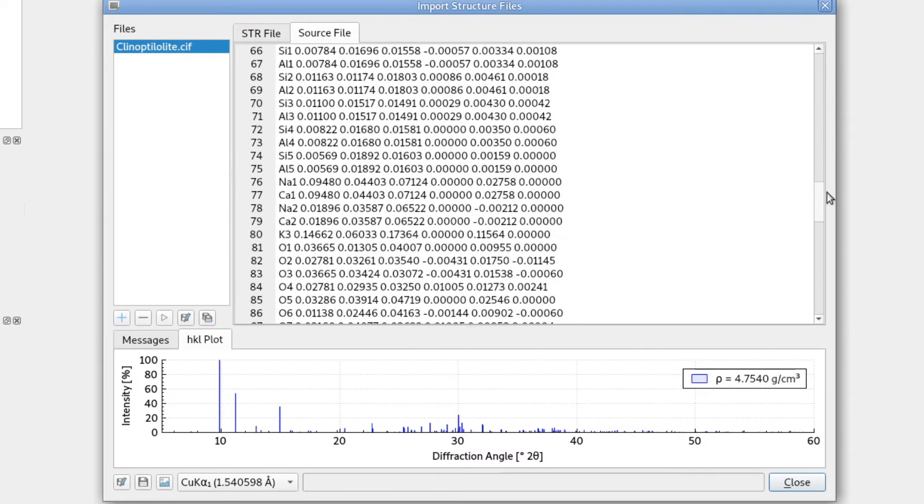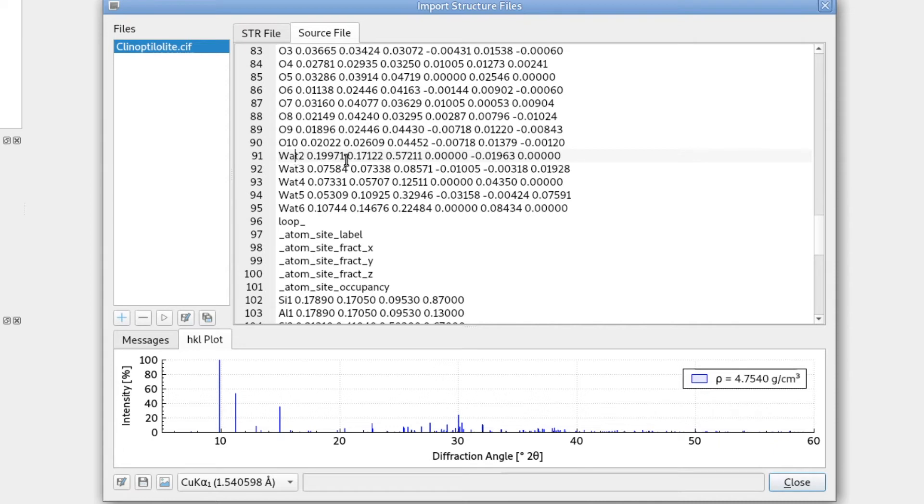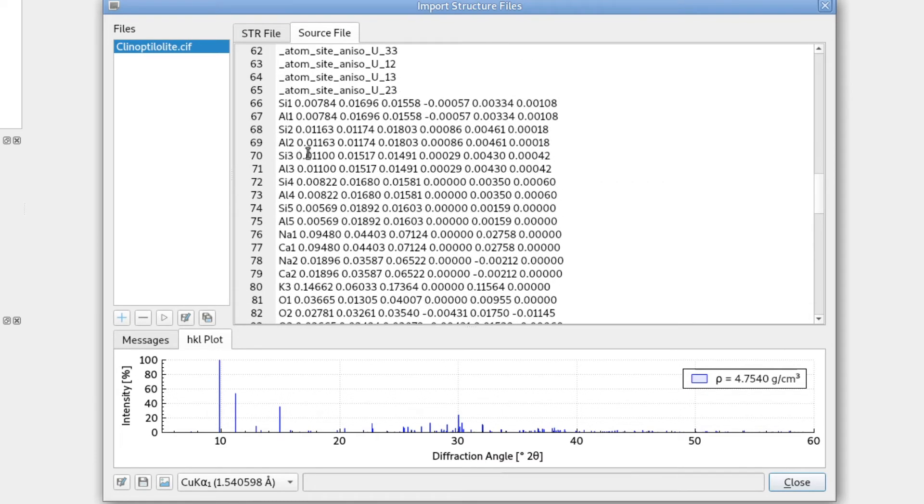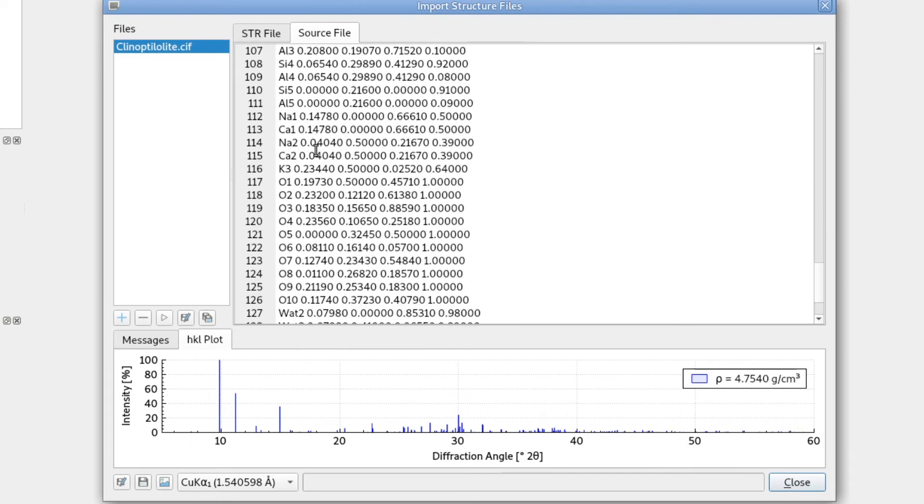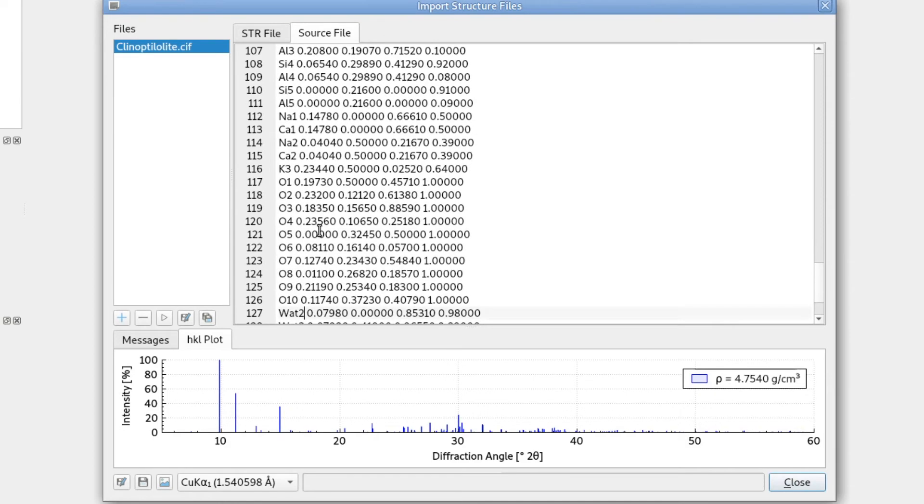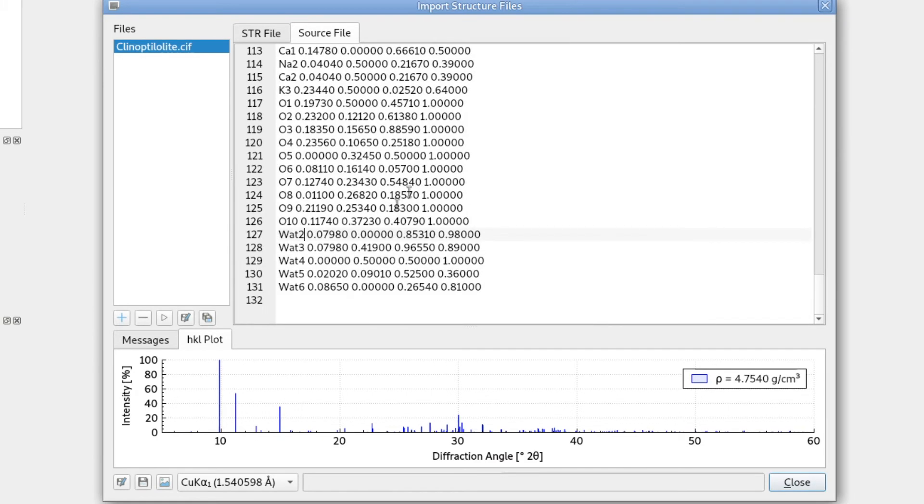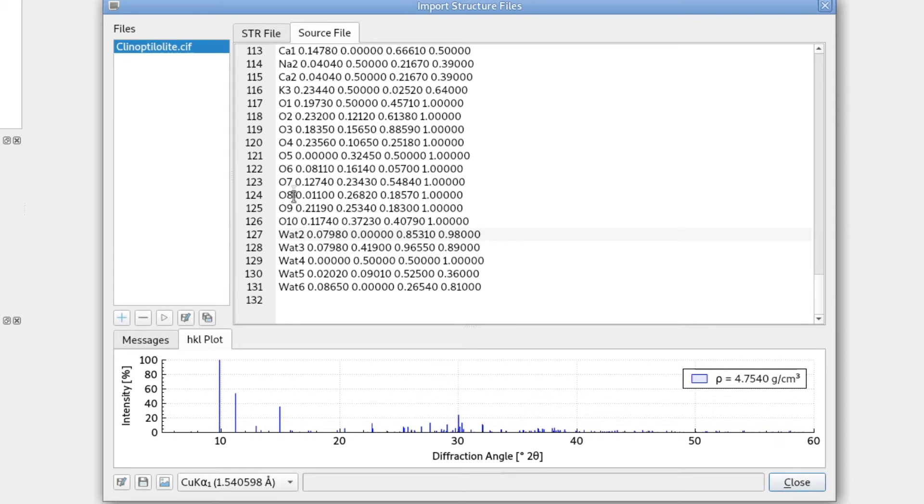And we can see five positions that are named with water and a number. So water molecules in the structure, in the channels of the zeolite, are named as water. And there is no information about the element. Of course, these are usually refined as oxygens. They are just labeled water to indicate that it's not a framework oxygen, but it's an oxygen which is part of a volatile water molecule. So this is how the authors of this structure distinguish between framework oxygens and water oxygens.